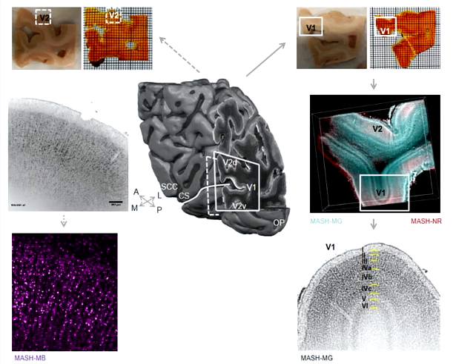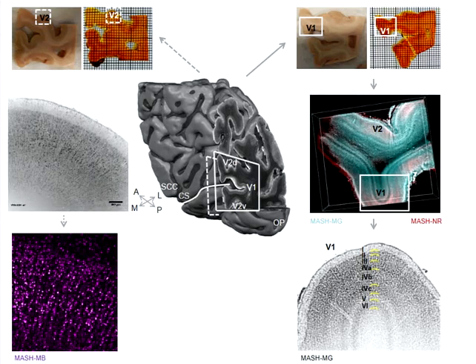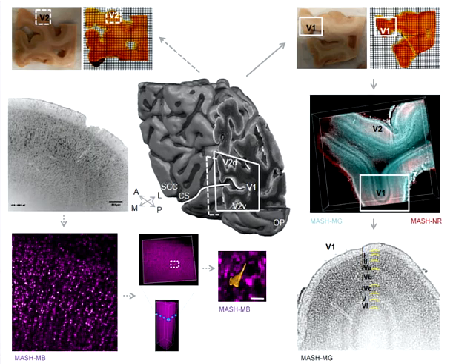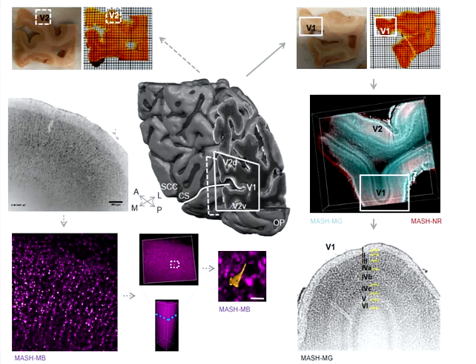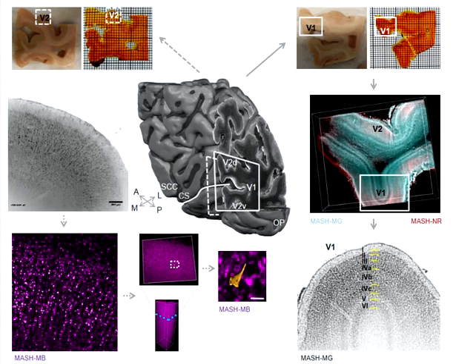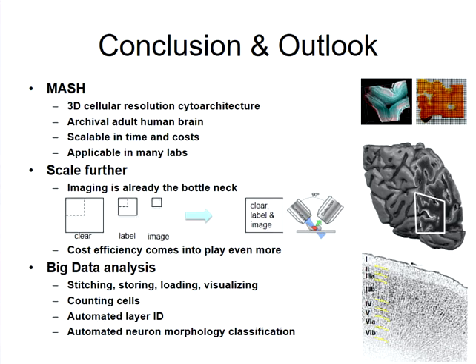Here's layer 1, 2, 3, and 4. In the context of that particular 3D stack, we can go in about 1.5 mm and create a 3D reconstruction of a single pyramidal cell, to test the hypothesis that we can do cellular resolution imaging in 3D with this.